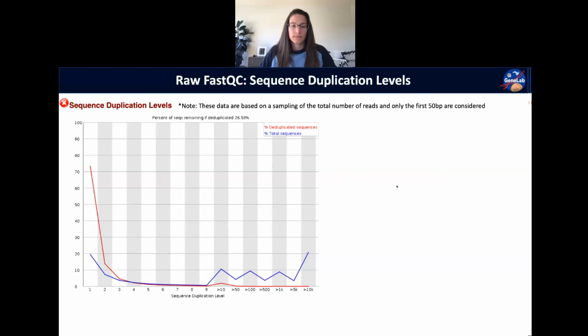And those we're okay with, because that actually came from the sample. It was derived by biology. It was nothing that we did. The other form of duplication is a technical duplication. Actually, we're going to start tomorrow after we talk about strandedness. We're going to start tomorrow by looking at different types of technical duplication. But technical duplication is another way that you can get duplicated reads.